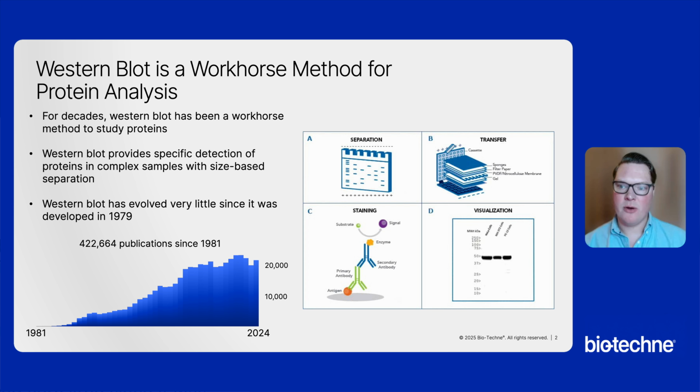Western blot is an immunoassay that provides specific detection of target proteins in complex biological samples. Since it was developed in 1979, Western blot has evolved relatively little, and the basic steps of separation, transfer, staining, and visualization have remained the same.